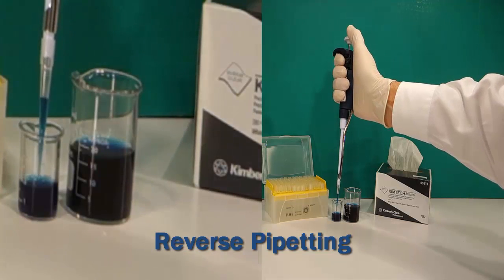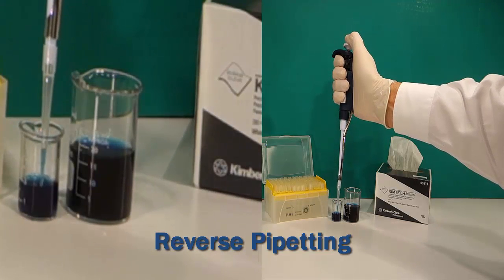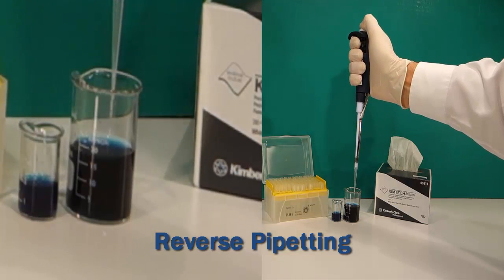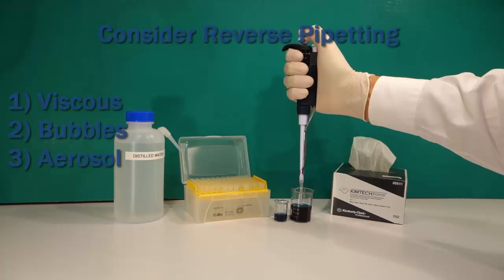Here it is again. In summary, think about using reverse pipetting when your liquid is slightly viscous, when bubbles could be problematic, and if aerosol could cause a cross-contamination or a biohazard risk.